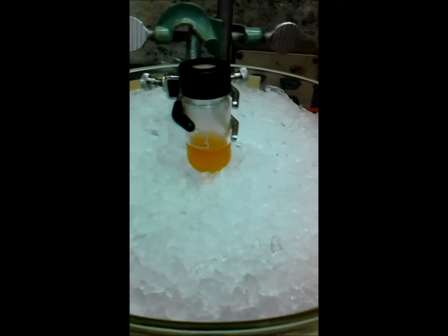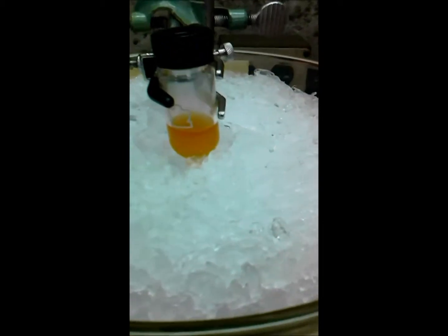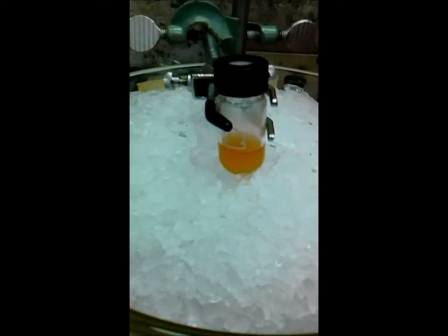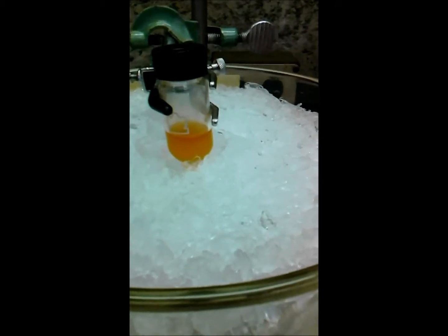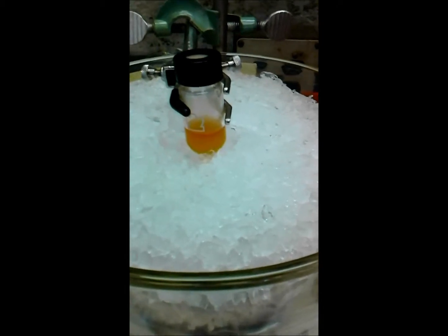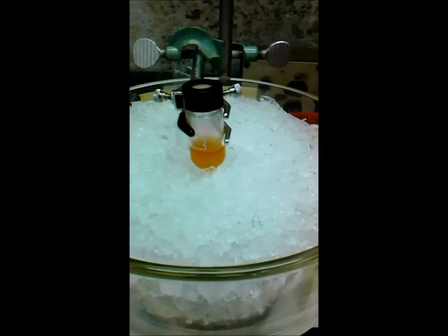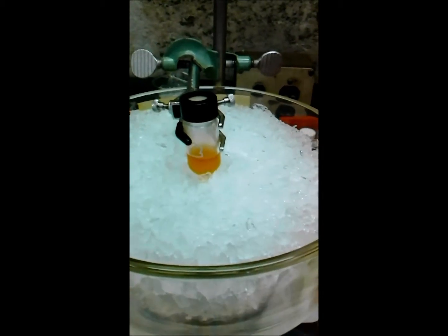Alright, after the third addition of 200 microliters, it's starting to look more like urine color, definitely dark orange versus dark yellow. We've added about half of the acyl chloride and the DCM, and there are definitely a lot more solids in the reaction now. I don't think the stir bar is really moving the solution around too much, so over the next 20 minutes we'll add the remainder of the acyl chloride and then look at acidifying it and purifying it, or extracting it out with DCM.